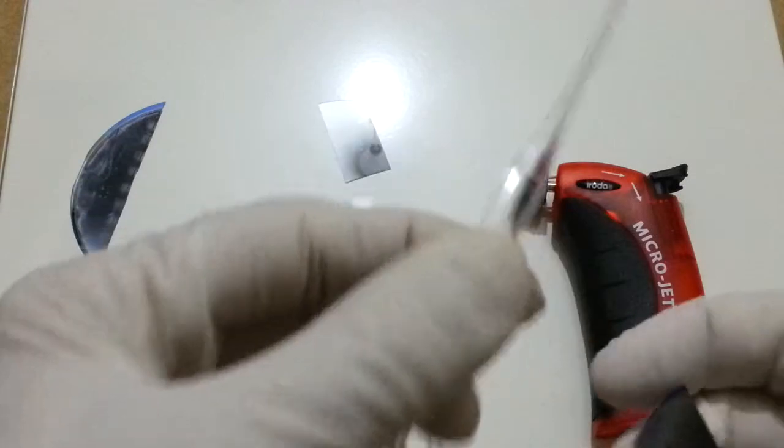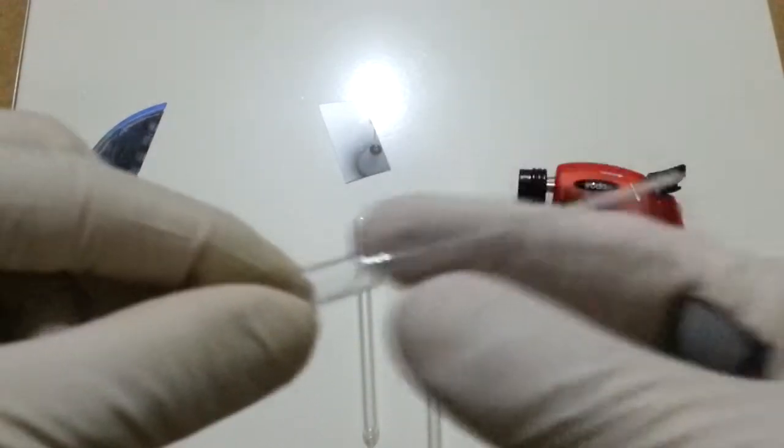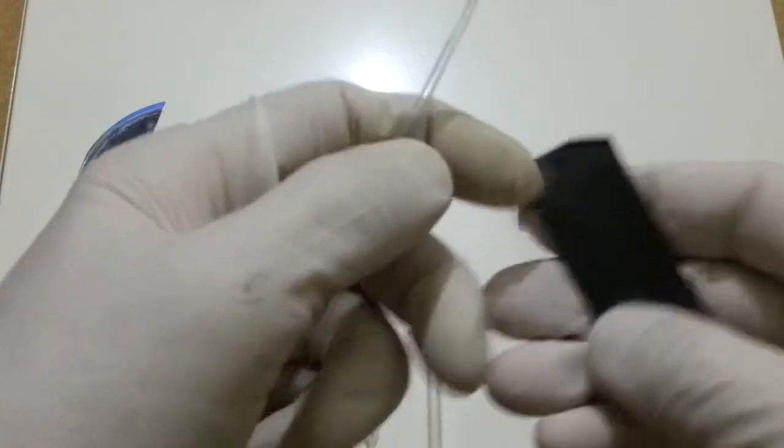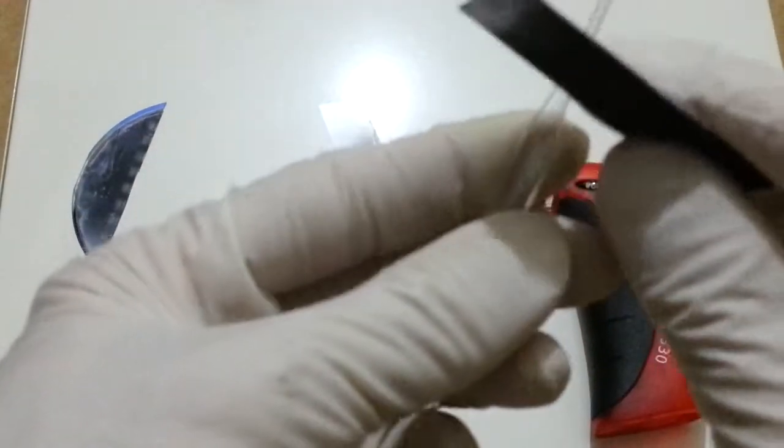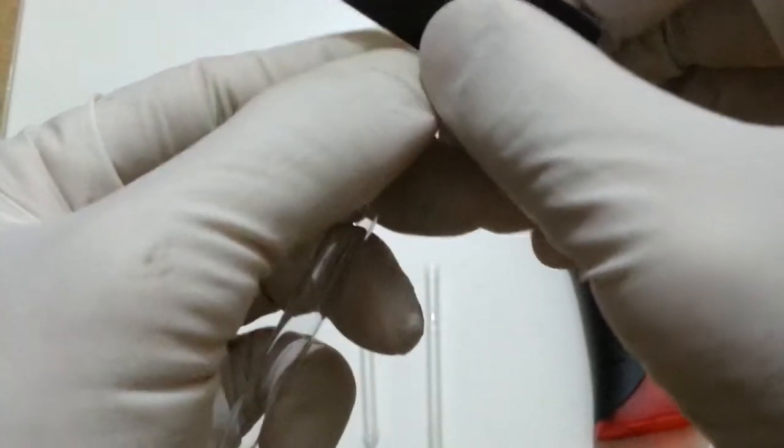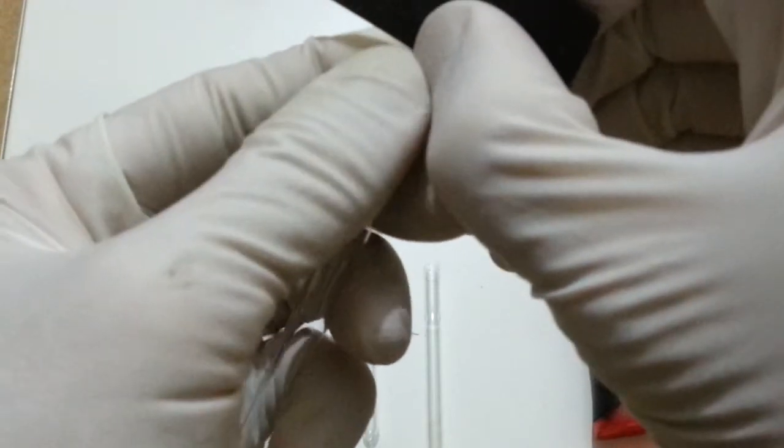Alright, so let's start by making a little scratch because we want this tail of the Pasteur pipette. So we are going to make a scratch here. Doesn't have to go all around.